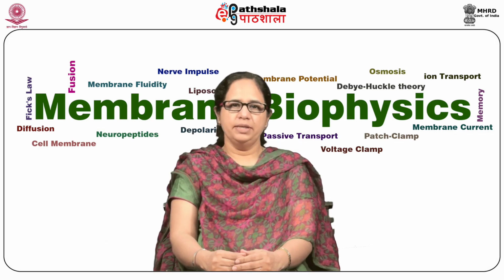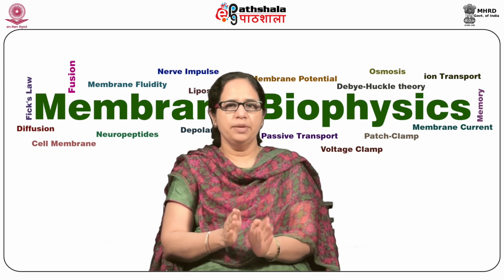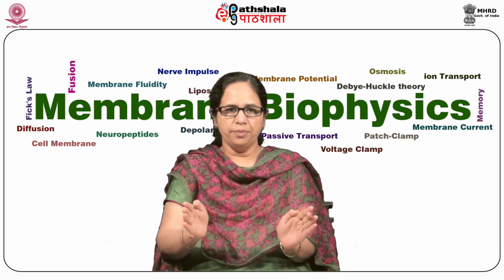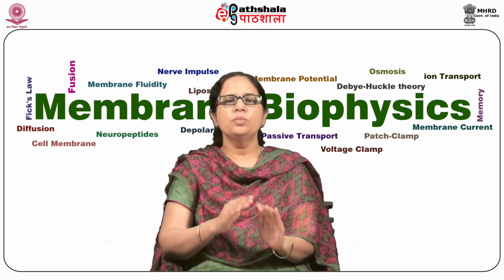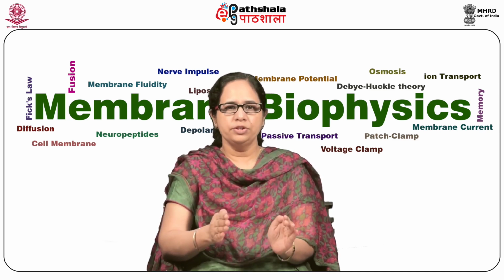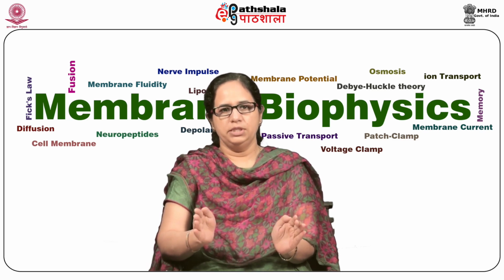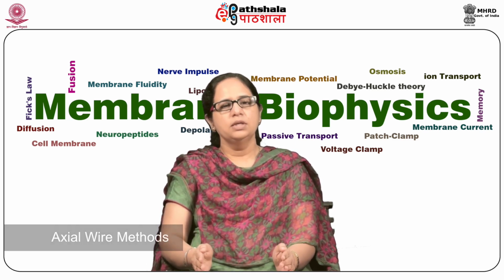Variations of voltage clamp techniques. A variety of different voltage clamp methods can be used to study the properties of the membrane. The choice of method depends mostly on the size and the shape of the preparation to be studied. I mean, preparation means different types of cells to be studied. The first one is the axial wire method.